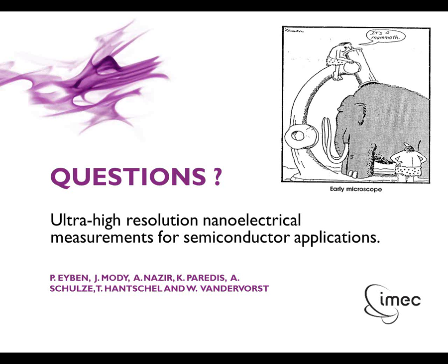Thank you. Here is a question, noted as a question for Pierre. Can you comment on measuring the resolution of the technique versus the resolution of the tip? Which one would you say it is? I'm not sure I understand. What I told you is that the radius of curvature of the tip is much larger than the spatial resolution that you can get. That's the first comment.